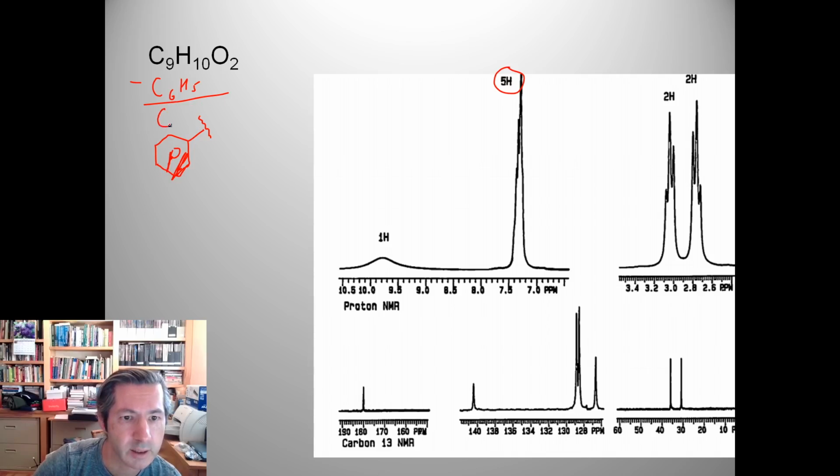And it's going to give us C3H5O2. And we can't see what's going on with the splitting. It doesn't matter. This is mono-substituted. We have to have one substituent on that ring. And we just have to deal with three of our carbons now. One of those carbons is actually a COOH. So here's 2 of our puzzle pieces.